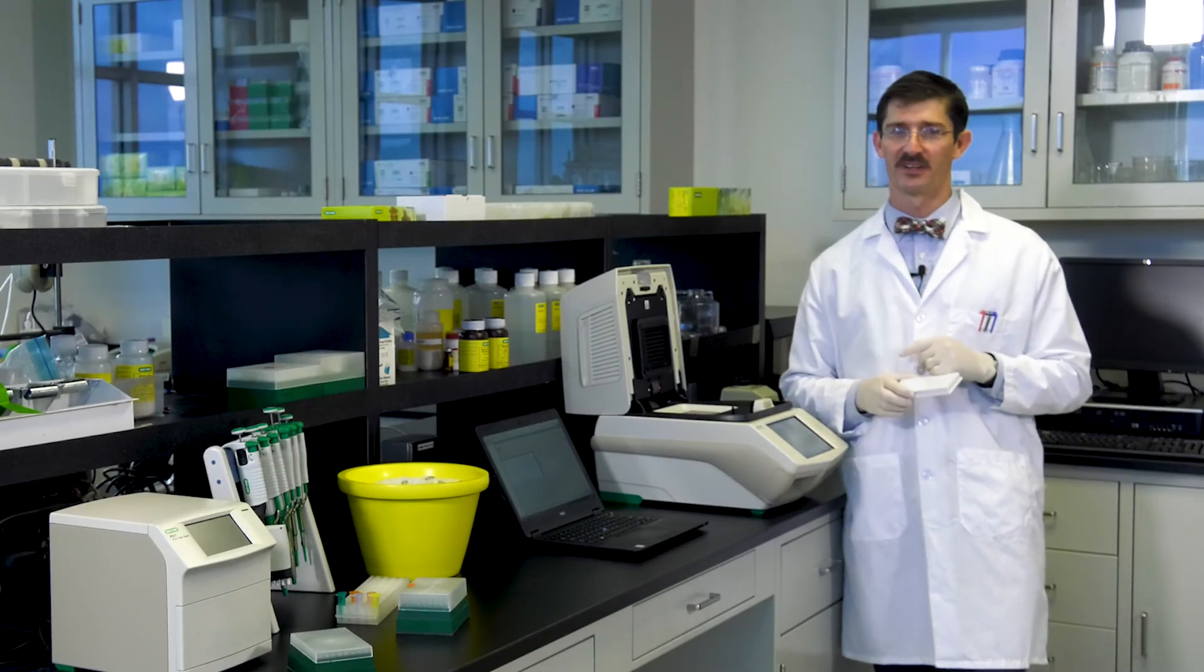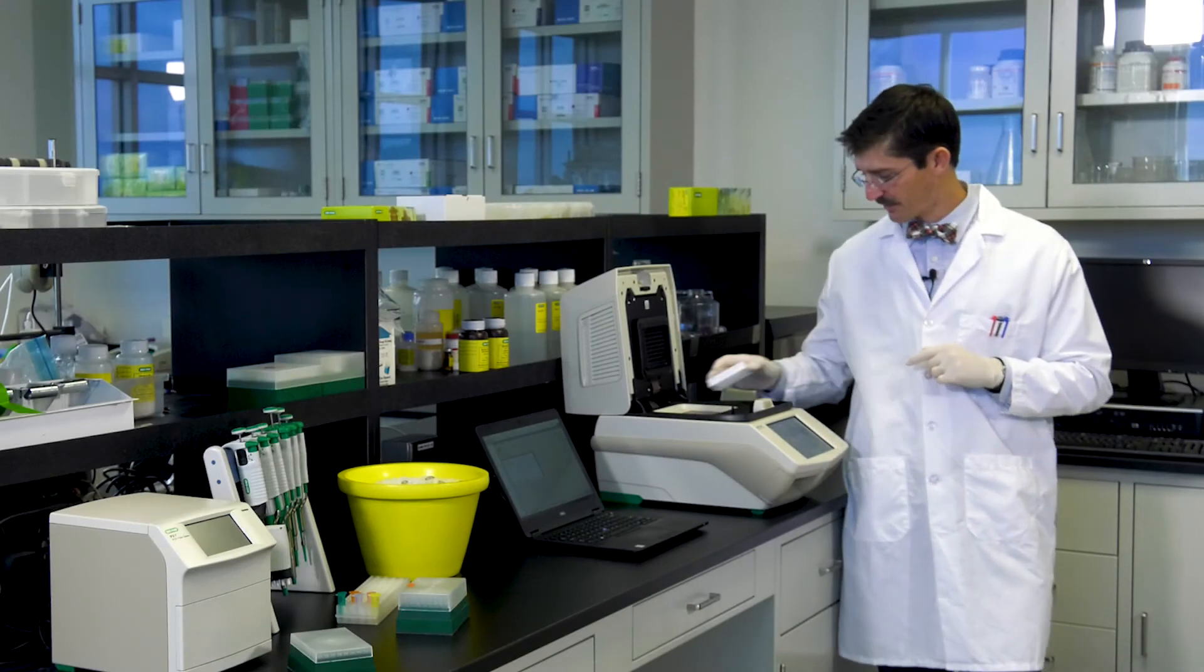As you can see, getting a real-time PCR run started in CFX Maestro can be done quickly and efficiently. And this is even easier when using pre-designed Prime PCR plates. Until next time, all the best with your real-time PCR experiments.